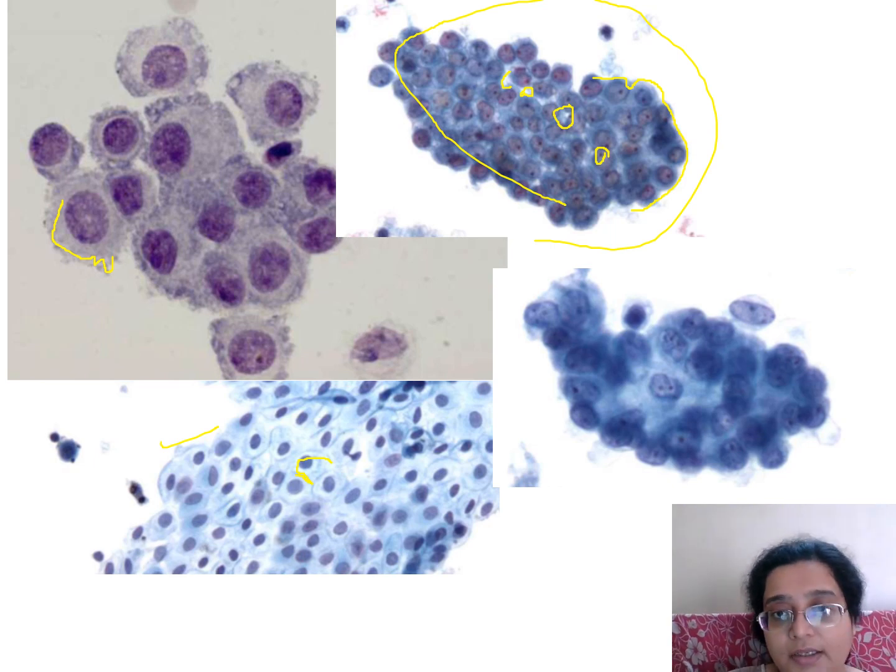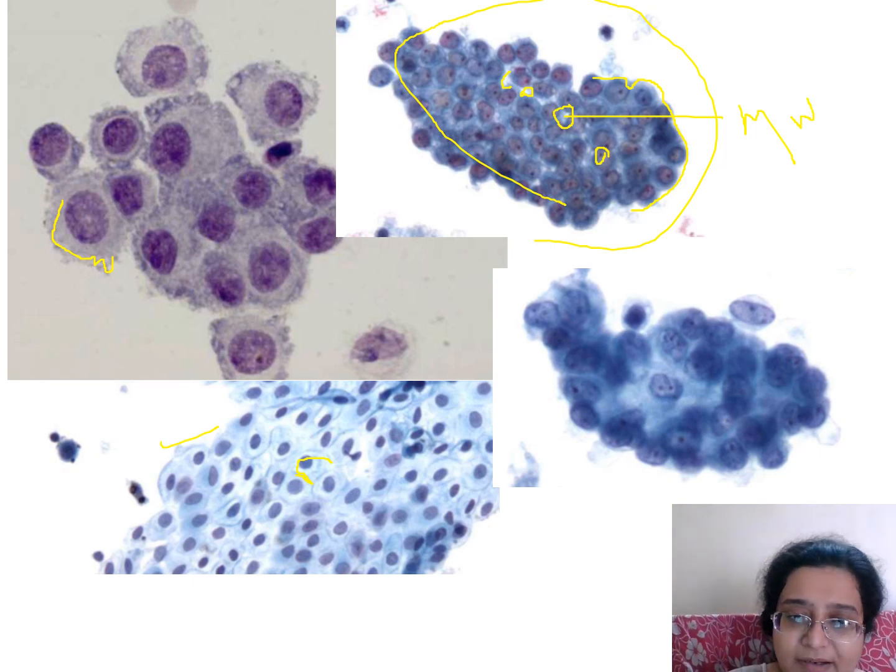This is known as mesothelial windows. This is known as mesothelial windows. So this is there, honeycomb pattern is there. Even if there is some nuclear atypia, I'll show you ahead. But if you are getting this, then this is benign or reactive rather than calling it malignancy.